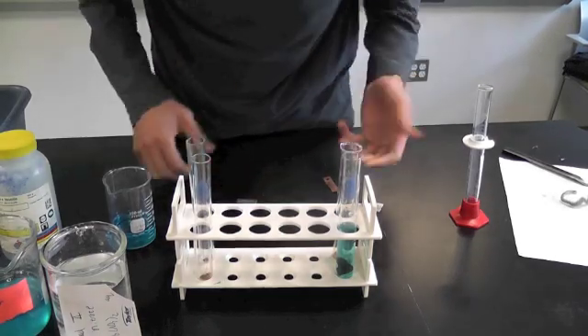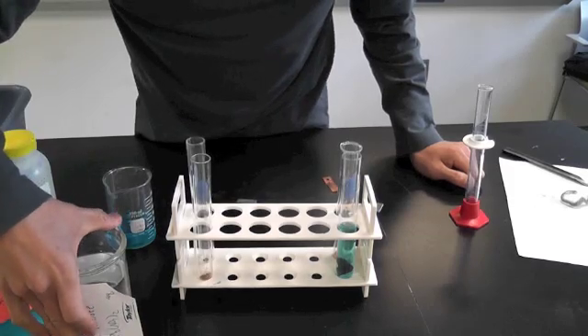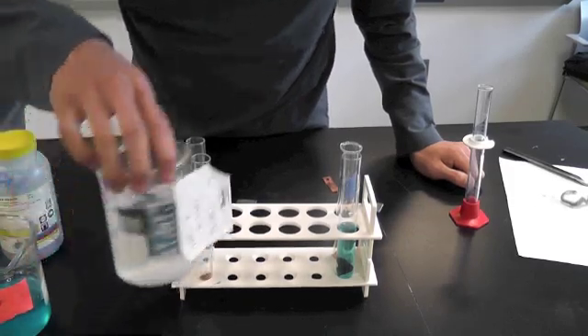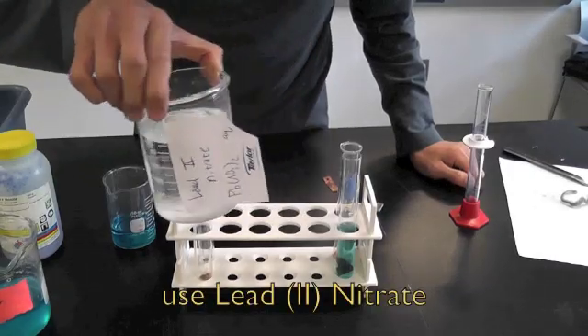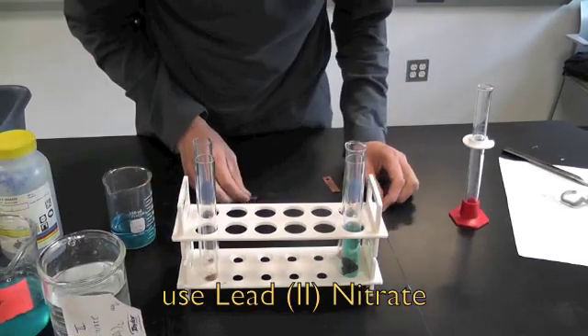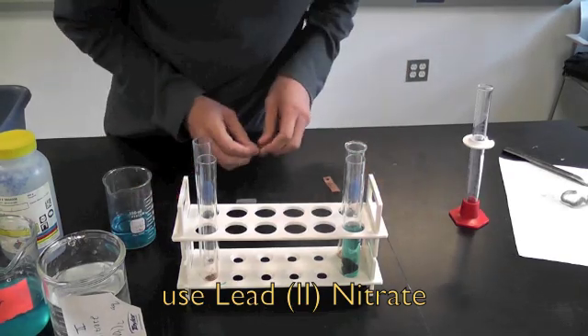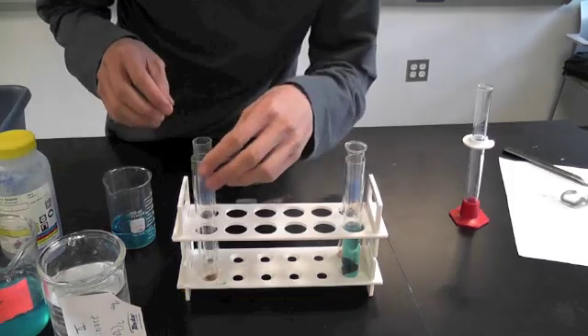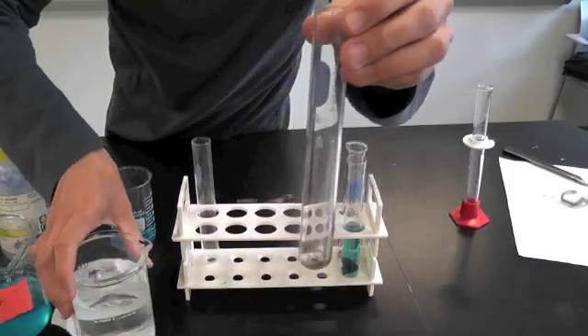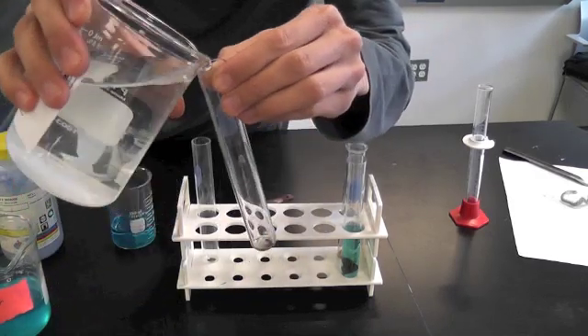And you have some kind of solution — an ionic compound dissolved into water to make a solution. Here we have some lead nitrate solution. The reaction involves oxidation and reduction, and a lot of good stuff with nomenclature and compounds in general chemistry, but the reaction itself is very simple. Here we have a normal test tube with the lead nitrate solution.